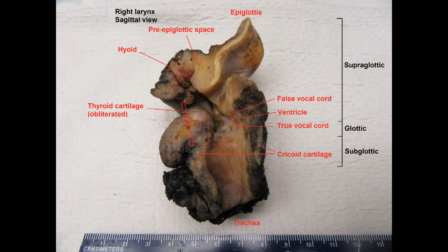For glottic tumors, there's not really much more normal sections you can give. I don't really need anything above or below. If anything looks odd within the infraglottis outside of the tumor, then certainly sample it, especially along the mucosa, because you can sometimes get skip lesions, or skip dysplasias that will spread.